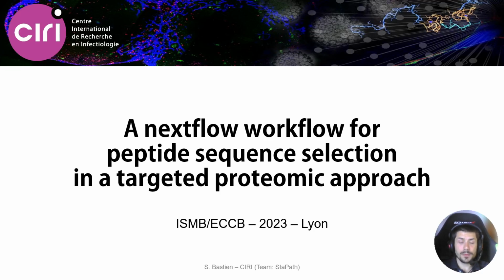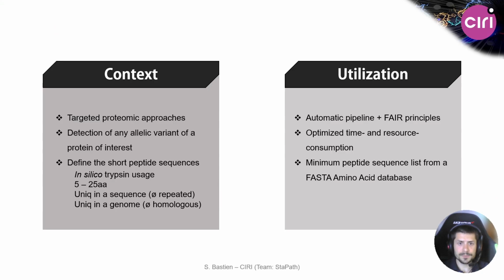I am a bioinformatician at CIRI located in Lyon, in the staphylococcal pathogenesis team led by Professor François Van den Esch. I'm going to talk about an ongoing project regarding the development of an automatic pipeline using Nextflow for the selection of peptide sequences in targeted proteomics.